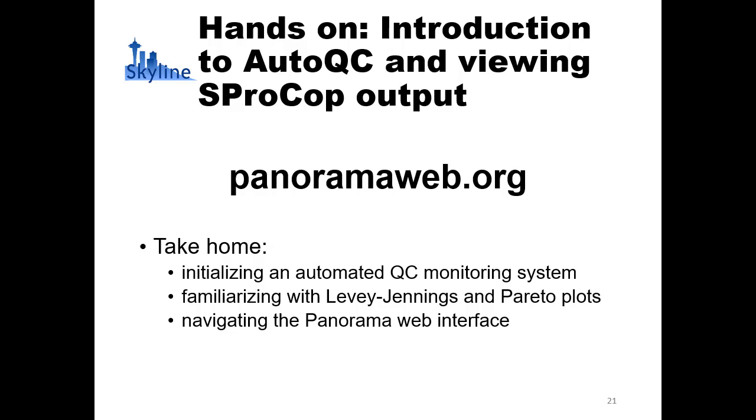But now I want to put all the lecture stuff behind us and move on to a little bit of an introduction to AutoQC and show you how it actually works. If you'd like, you can play along by going to panoramaweb.org. If you would like to just follow my slides, that's fine too. The three points that I hope you take home from this are initializing an automated QC monitoring system, familiarizing yourself with these Levey-Jennings type of plots, and then navigating the Panorama web interface.